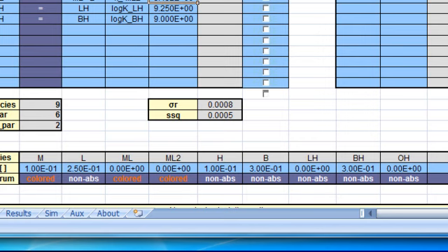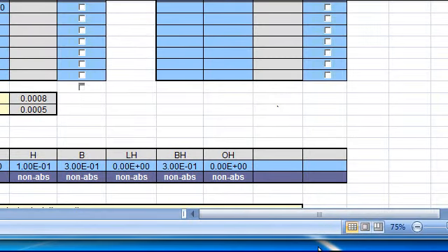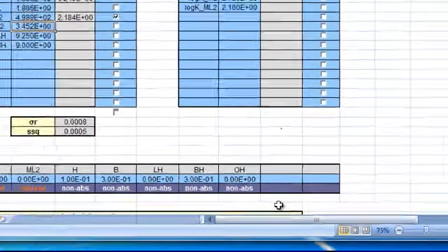To compute the actual protonation equilibria position, ReactLab needs to know the total concentrations of the components, which it can work out from these entries along with the protonation constants. It should also be noted that the OH species is introduced automatically if protons, H, are included in the mechanism. The equilibrium defined by the ionic product of water, Kw equals H times OH, is then included in the computations to correctly model pH changes.